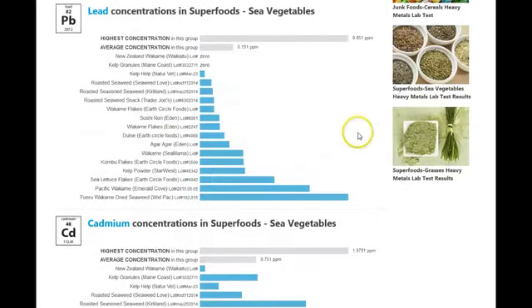And the other thing to think about here is that all of these results were actually tested on the same instrument with the same external standards and the same methodologies. So someone could potentially argue about whether it's exactly 0.851. Different labs are going to give you slightly different numbers. Another lab might do 0.827 or 0.889 or something like that. Typically, labs can disagree by 10 or sometimes even 20%, depending on the methodology. But the relative concentrations will be very precise from lab to lab. So if another lab does all of these tests and charts a curve, they will get almost precisely the same curve that we have here, even though these numbers might be slightly different on the total scale. You see what I mean? The relative concentrations are going to be very, very accurate from lab to lab.